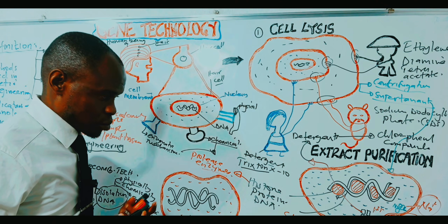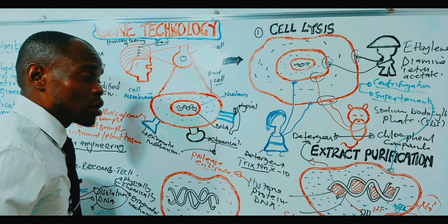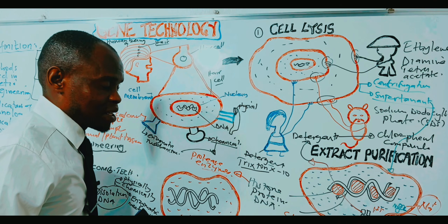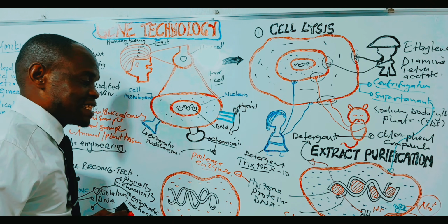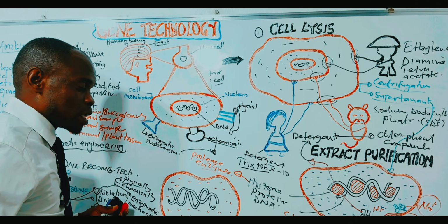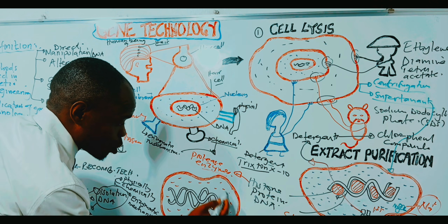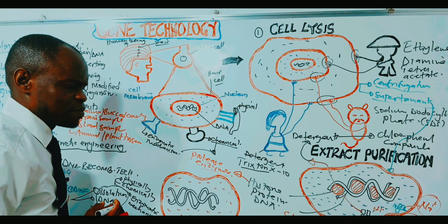You get? Then, after removing these components, we have already done purification. You get? Purification has been effected. What is going to happen next, members? We want now to do the last procedure, because the proteins have been removed. So we have the DNA remaining alone, plus the cellular contents like the water inside there.